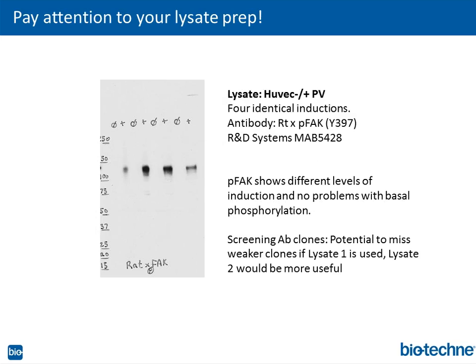Another example, same exact conditions. This is a phospho-FAK antibody, showing exactly the same treatments, exactly the same cells, and the pre-induction is all very clean, but the post-induction gives you varying signals. And the question is why? Well, there's variations here potentially, and this was actually used to pre-screen the lysates to then be used to screen clones.